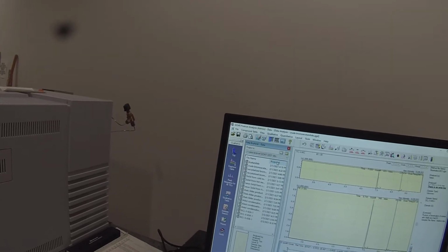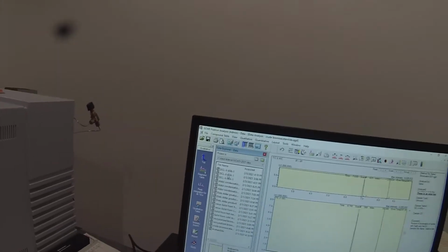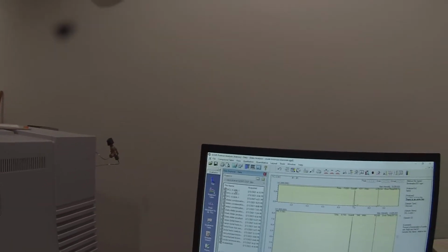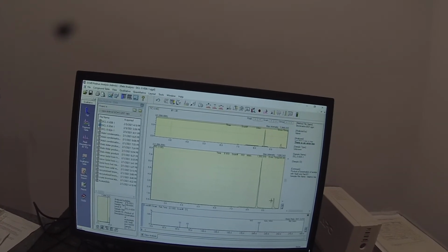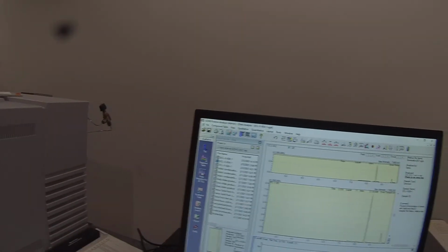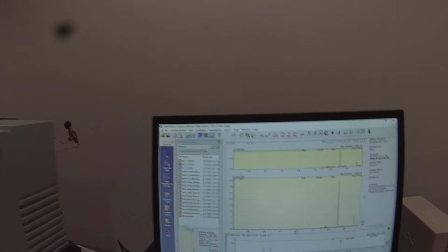Do this by when they were acquired. So 65A-1 and 65B-1. 65A-1 is the crude. 65B-1 is the recrystallized. So we'll open up 65A-1. Notice we got a couple of peaks here. So we're going to do an integration. Take the defaults and see if it works.